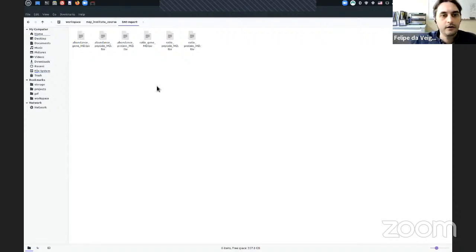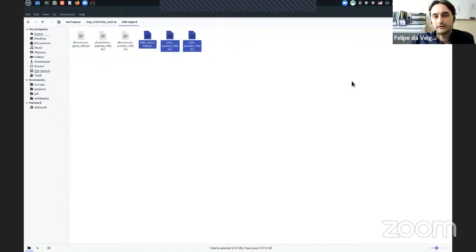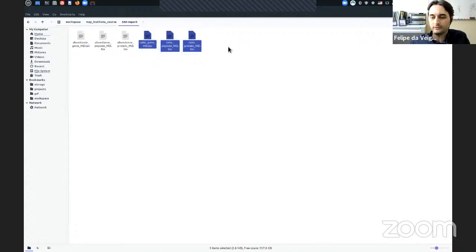All right, thank you. Okay, so let's take a look here real quick over this table. Right away you can see two sets of tables: we have abundances and ratios. It's basically the same data, but in the first set the quantification numbers are ratios to the references, and in the second set the numbers were converted back to the absolute abundances.